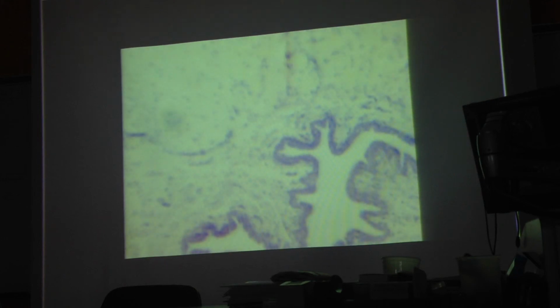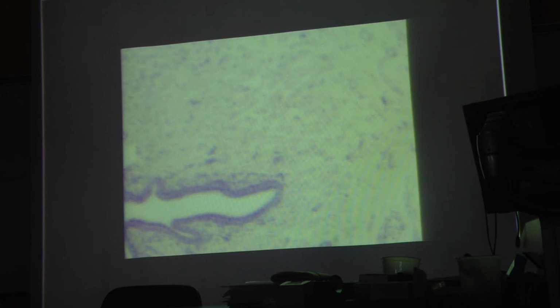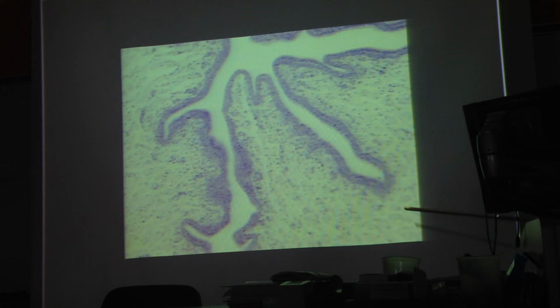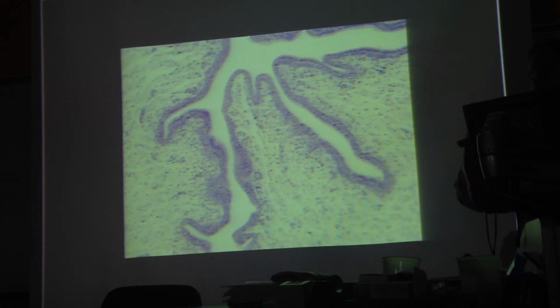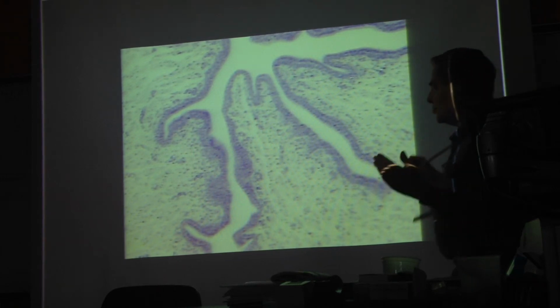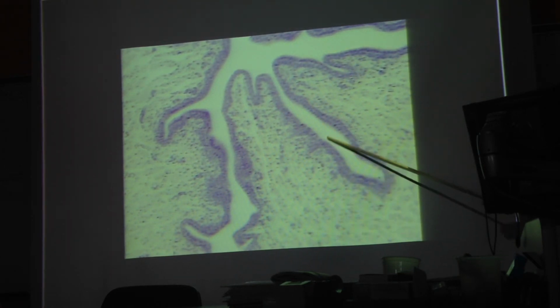Okay? So this is the urethra. And you can see all around it is this erectile tissue of the corpus spongiosum. What's the type of epithelium that lines the urethra? It's this purple stained stuff. Transitional. It's transitional. Transitional, remember, we've seen in the urinary bladder, we see in areas where there's a lot of pressure on the walls, so as urine passes through, it kind of stretches the tissue, and that causes the cells to change shape. They go from what appears to be a stratified columnar, to basically what's like a stratified squamous. Eventually this becomes a stratified columnar, cuboidal, but we just call it transitional. Okay? That's the epithelium that lines the urethra.